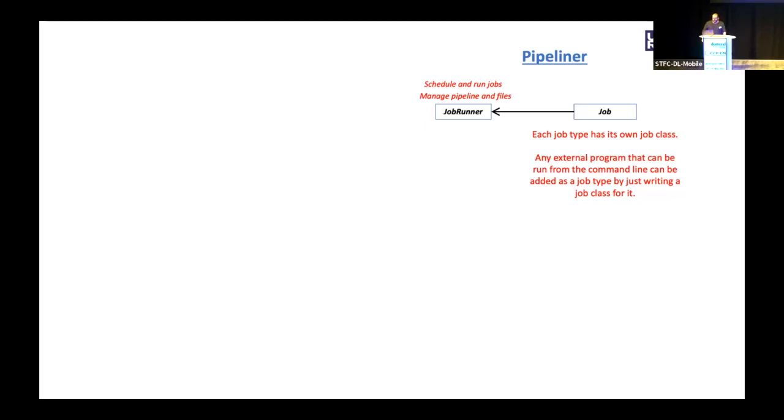The next layer of the pipeliner is the Python API, which handles larger functions. For example, the task of running a job may require 20 or more individual tasks to be accomplished. You have to parse the parameter file, figure out what command to run, make a directory to run it in, run the commands, check that they all executed successfully, and on and on.